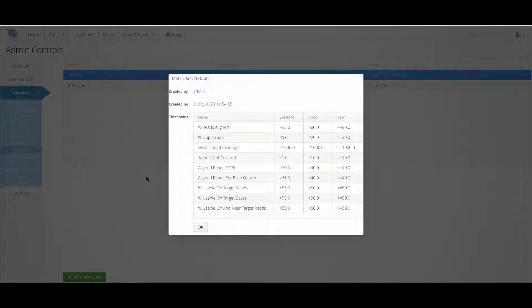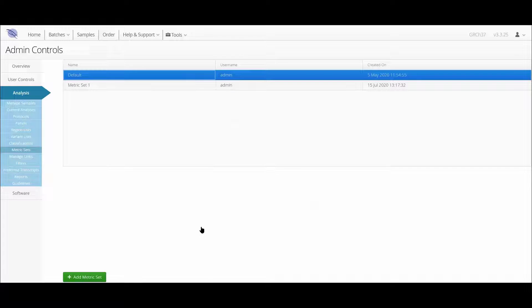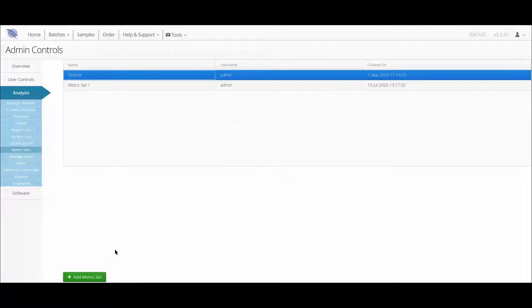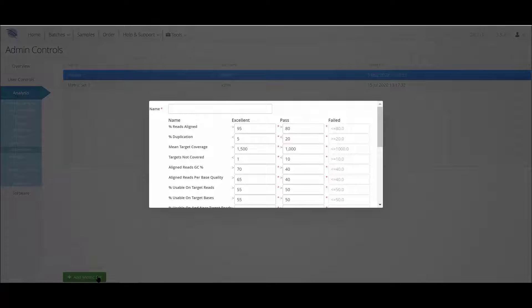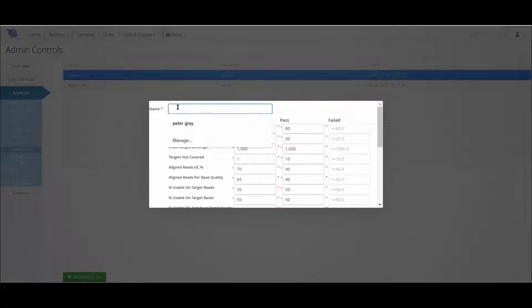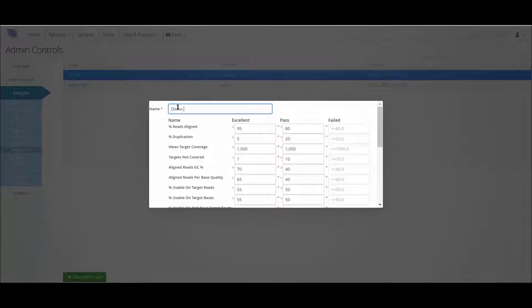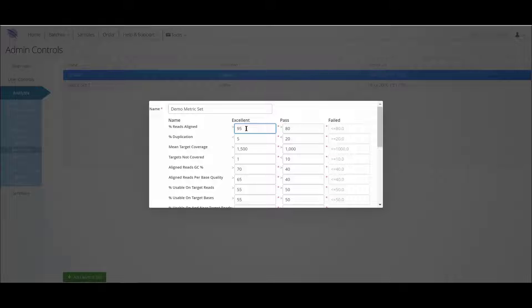If a user wants to modify these values, they can create a new metric set by clicking on the green Add New Metric Set button at the bottom of the page, and then changing the values in the relevant field. All the values have to be set before the new metric set can be saved.